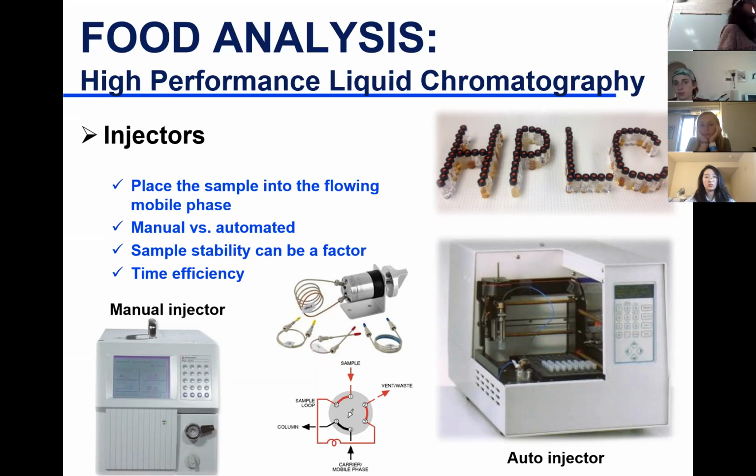However, if you have multiple samples and you know components might degrade, you would have a compartment, we call it a cooler, where your tray is cooled down to refrigerated temperature, like 4 degrees or something like that. So with this kind of analysis, if we have components that would degrade over time, you want to make sure they don't degrade during your run, so that you don't have the first few samples running nicely and having good data and the last few samples are erroneous due to degradation. So you would cool them using a cooler.